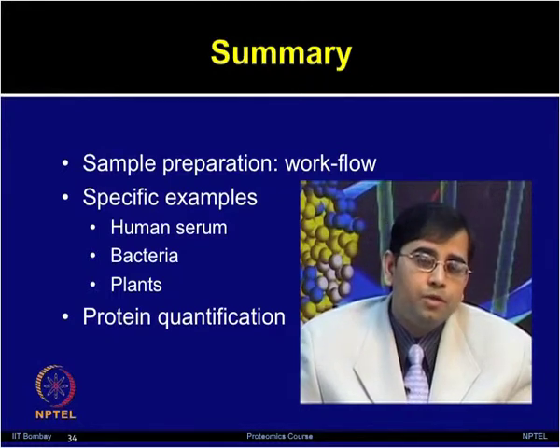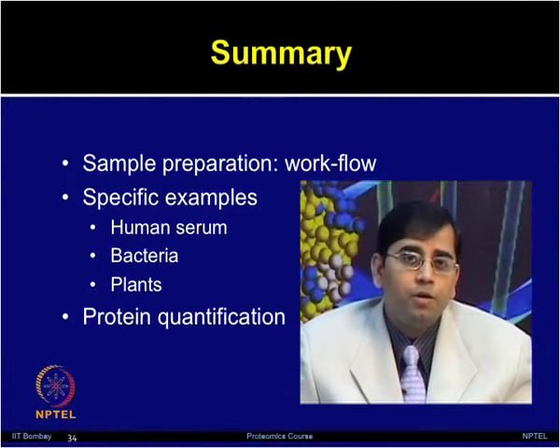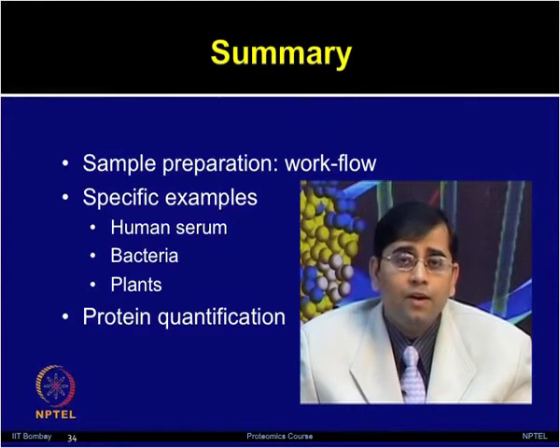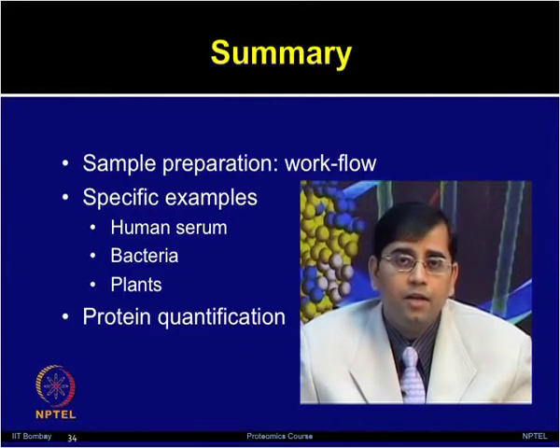Then we discussed bacterial protein extraction and how one can analyze the bacterial proteome. Then we talked about plant protein extraction for plant proteome analysis. Finally, we talked about protein quantification, how to determine the protein quantity present in your given sample.